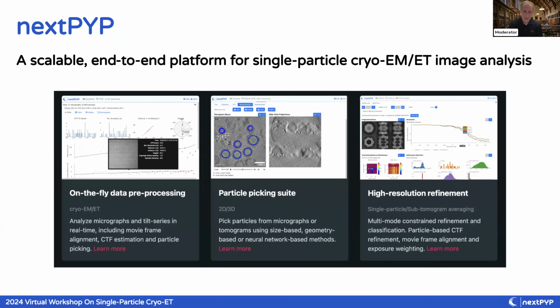So this is an overview, the introduction of nextPYP. It's a scalable, and I'm going to go through each of these terms one by one, it's a scalable end-to-end platform for single particle Cryo-EM and Cryo-ET image analysis. You notice that I said Cryo-EM and Cryo-ET. In this webinar, we're only going to focus on the tomography part, but for people that are curious, nextPYP also supports pretty much all the same operations for single particle Cryo-EM, but that's not going to be the focus of today's workshop.